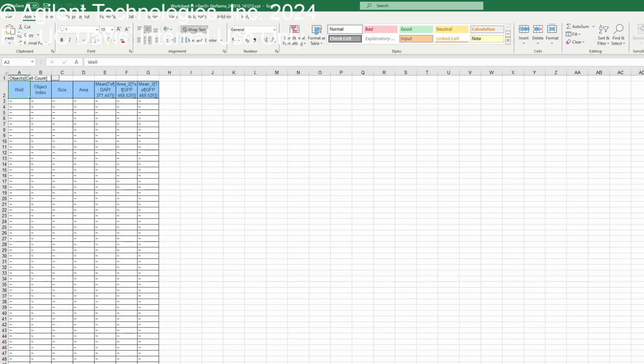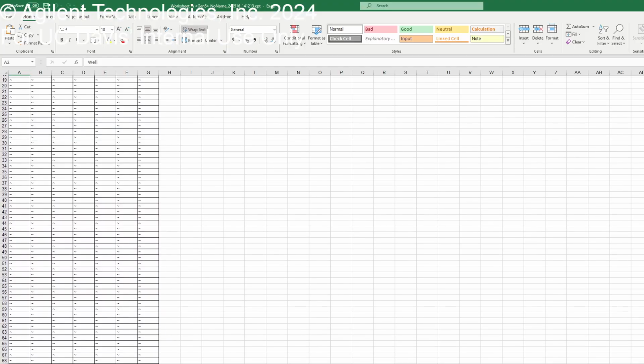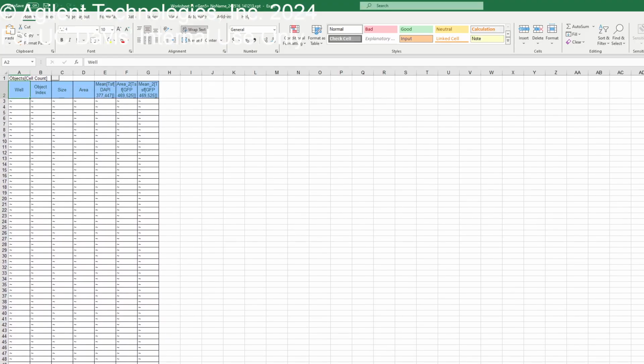Just really quick though, say I have 6 groups across a plate, but I want each sheet to be its own treatment group. Would I just have to do that multiple times? Yes, you can create more sheets and add different wells there. You can also group them by treatment. There is a well plate layout function where you can customize different groups, so it's much easier that way. But yeah, that works too.